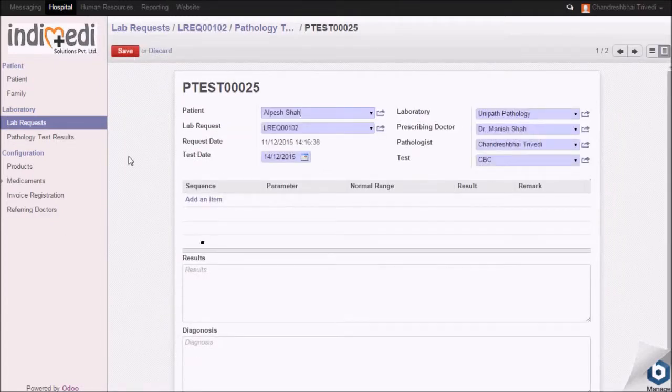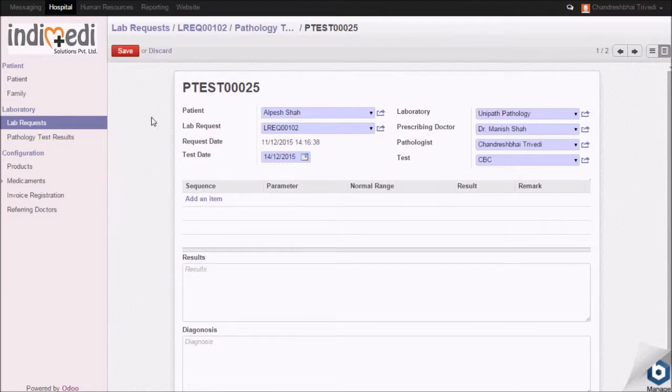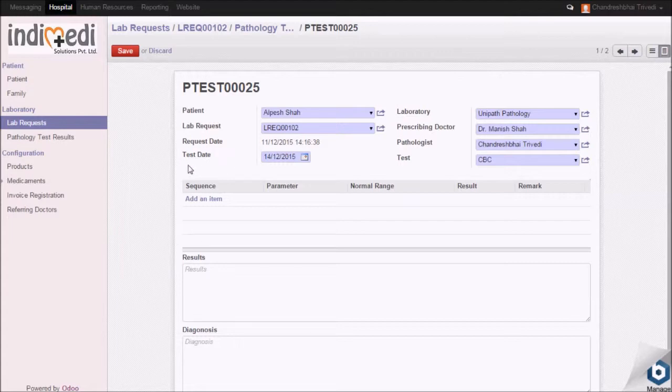Here, details such as patient's name, lab request, requested date, test date, laboratory, prescribing doctor, and pathologist name will be fetched automatically.